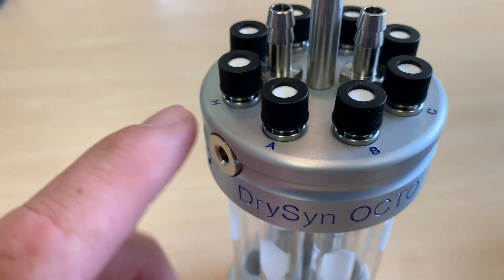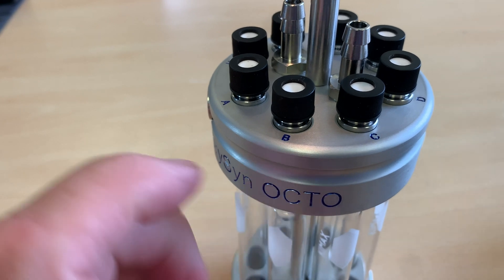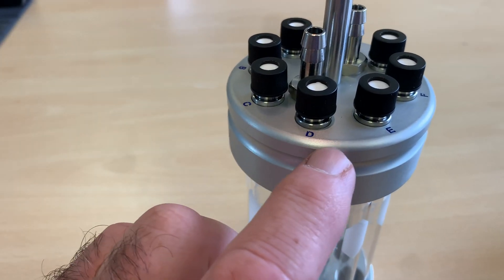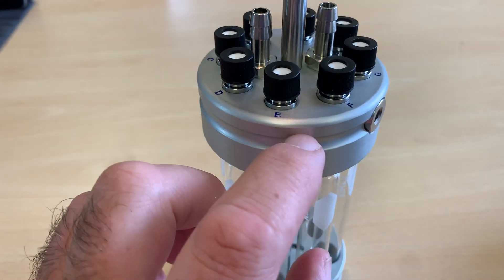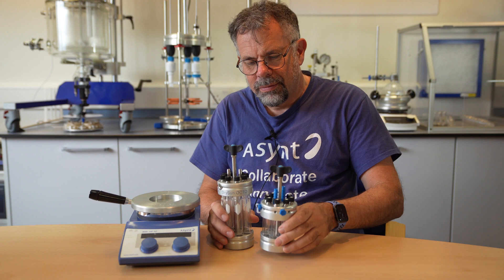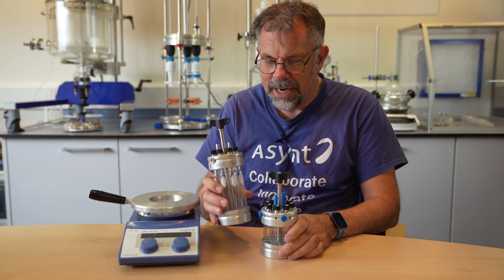I nearly forgot — we've now additionally labelled the top, so it's a little bit easier to see where you're putting your samples. To refresh you: the new Octo is exactly the same as before in standard length.